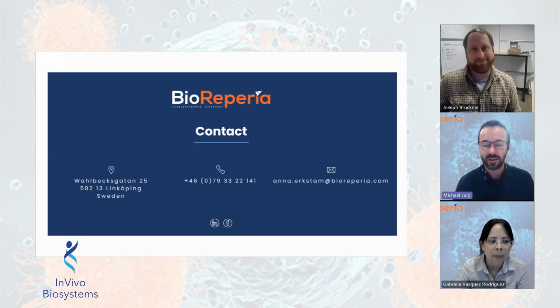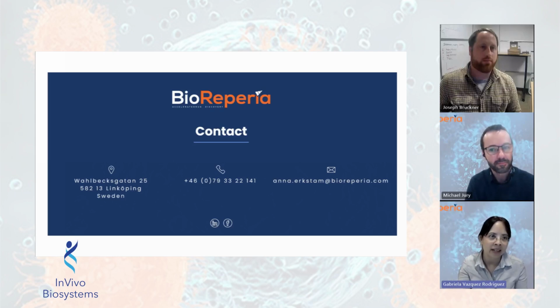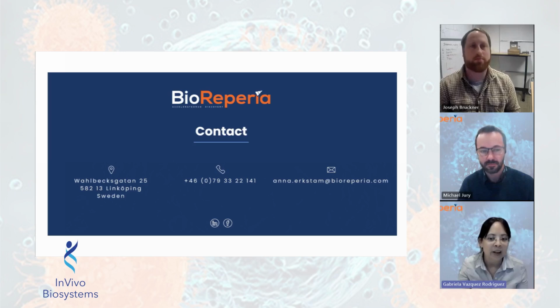So the fact that the embryos don't have an adaptive immune system, would this have maybe a negative or a positive effect, or no effect? No, well, we can see it from different angles. If they lack an adaptive immune system, that works to our advantage when working with xenografts, because we cannot have that rejection. But and probably this is where the question is going.